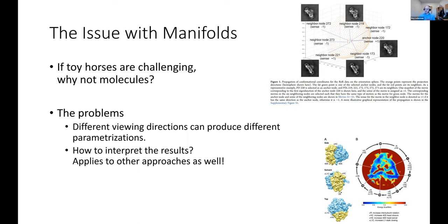For this technology, there might be something you can do if you go back to the original images and try to find where each piece of the mass moves, or something like this. But I think it's pretty difficult. It's not a generic solution for everything.